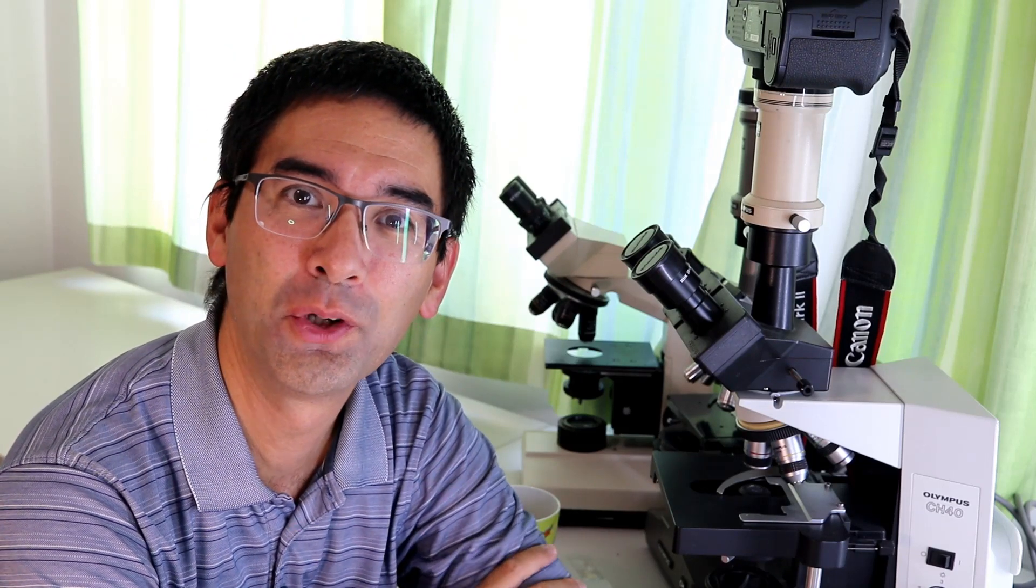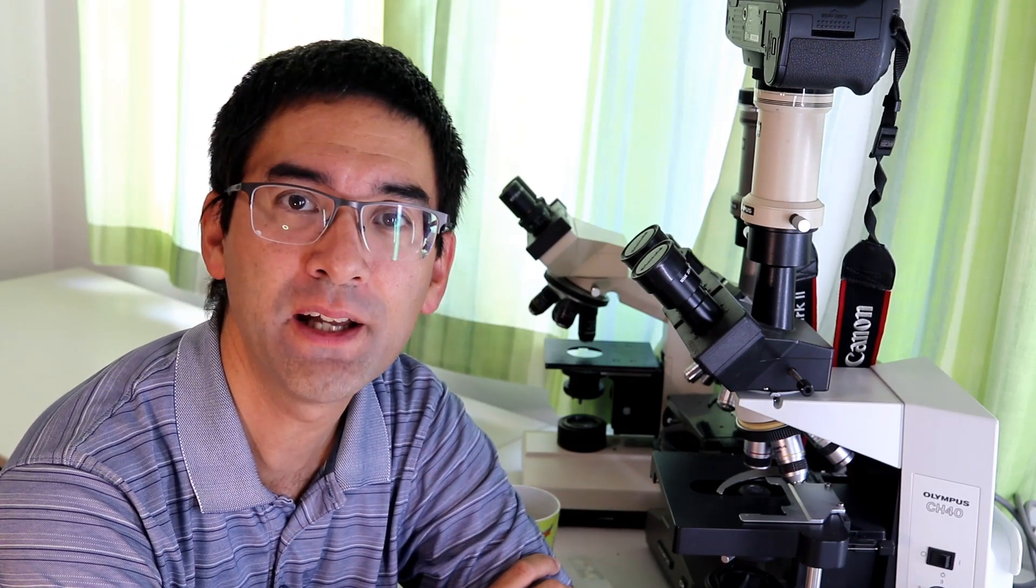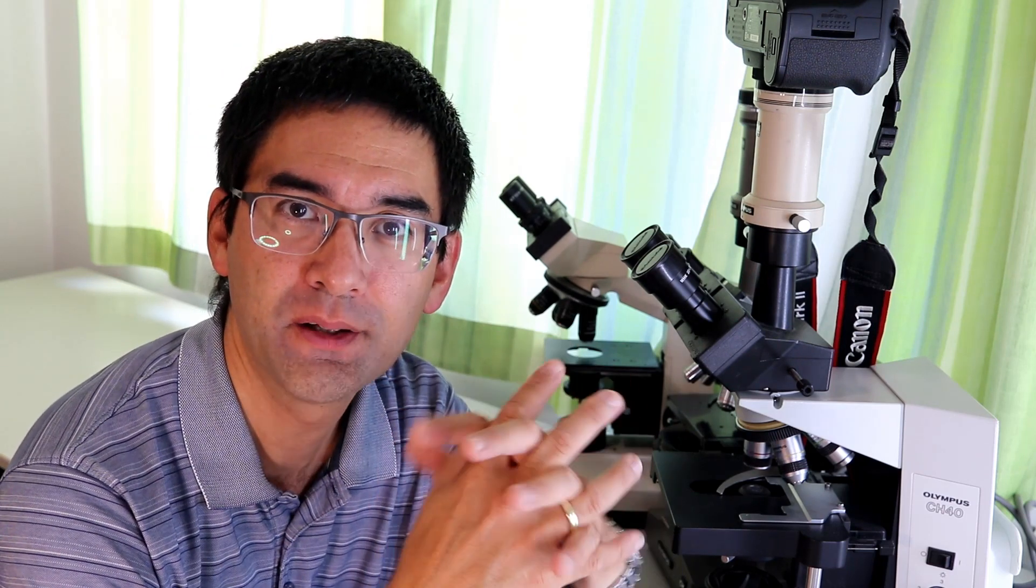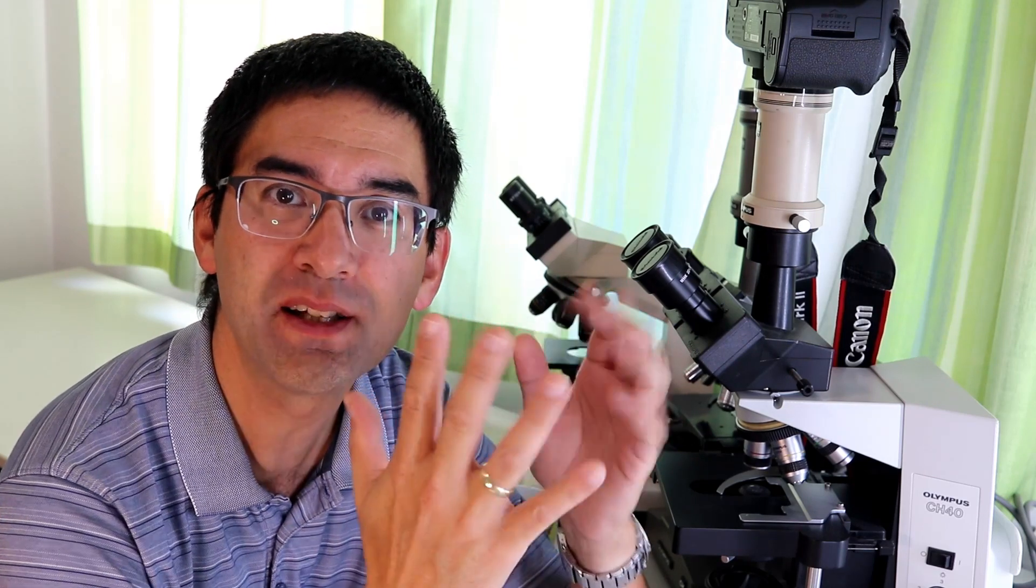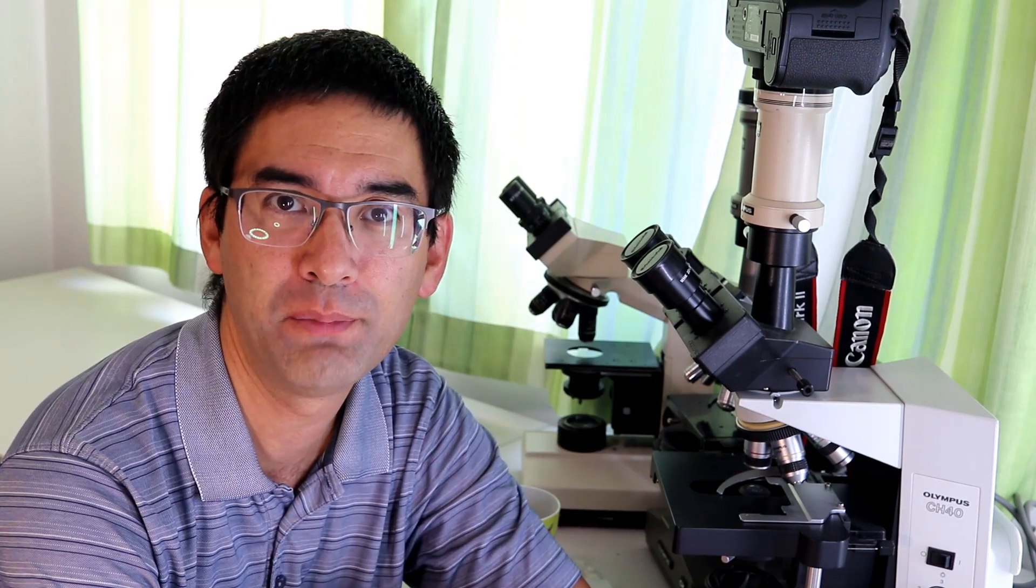Hello and welcome. One of my viewers has requested more information on the slide ringing table that I made. I've actually tried several possibilities, not all of them successful, and I decided to give you an overview of what I've been trying out.